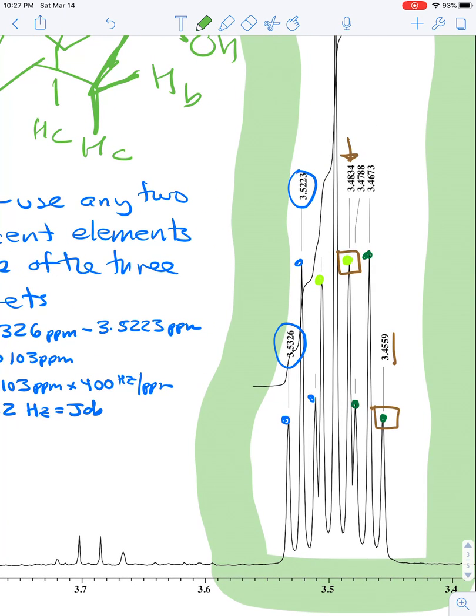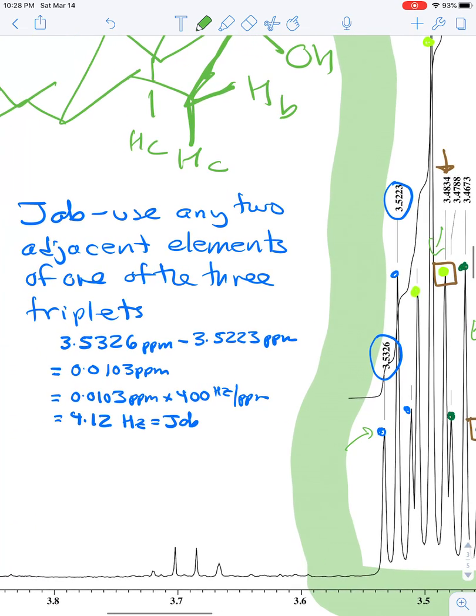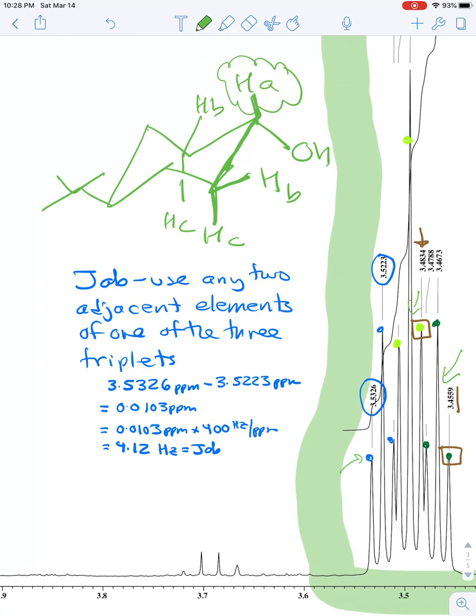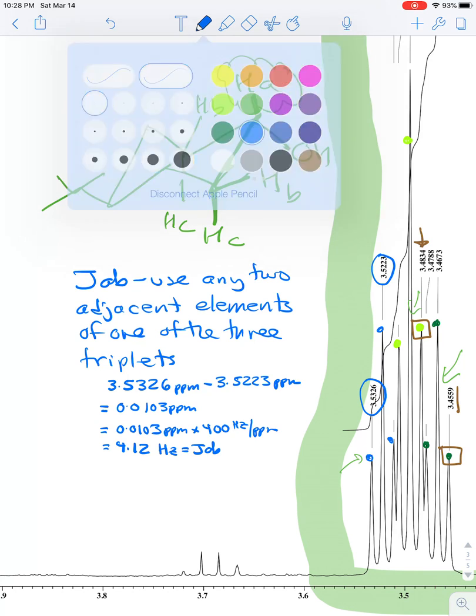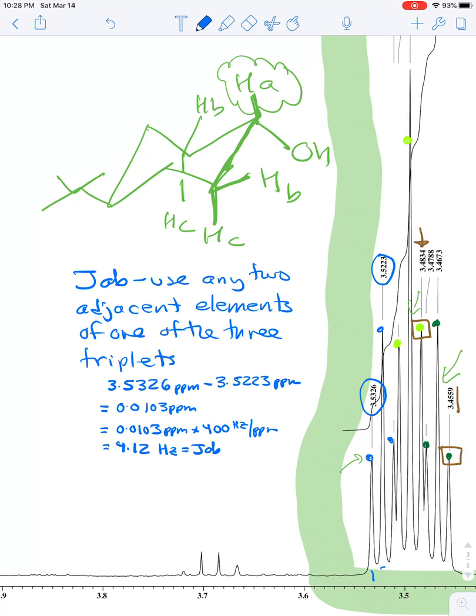And you can see that what I did here is I have each triplet that makes up the triplet of triplets written in a different color. So we have blue for one, and light green for one, and then dark green for the other one. And so in order to calculate JAB, which is the smaller coupling, we want to use any two adjacent elements of one of the three triplets. And so what I did is I picked signal 1 and signal 2, if you look at the total of the nine signals of the triplets of triplets.